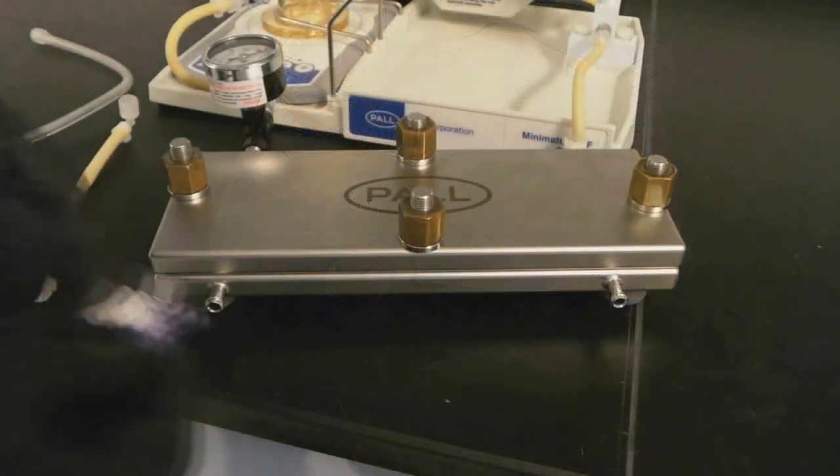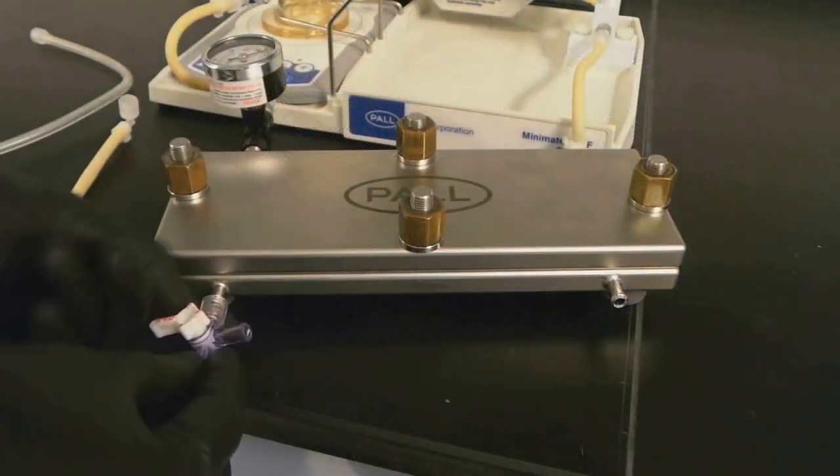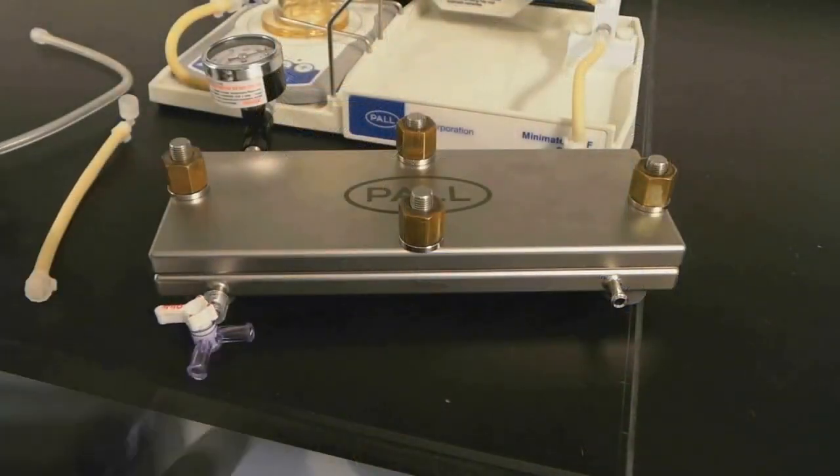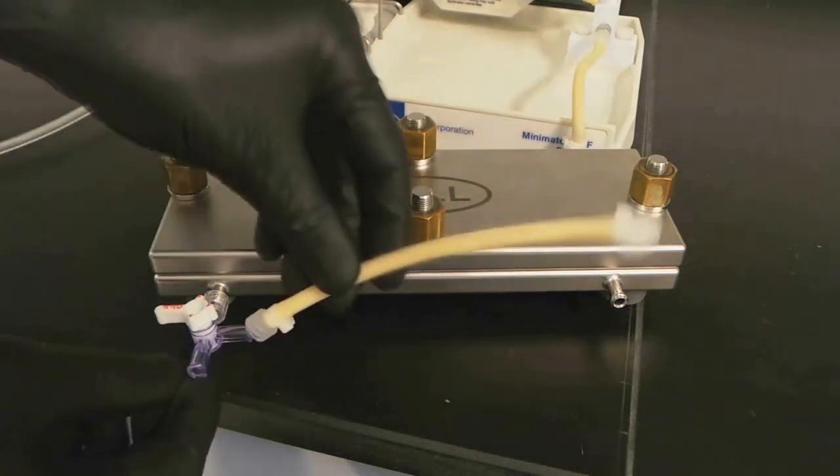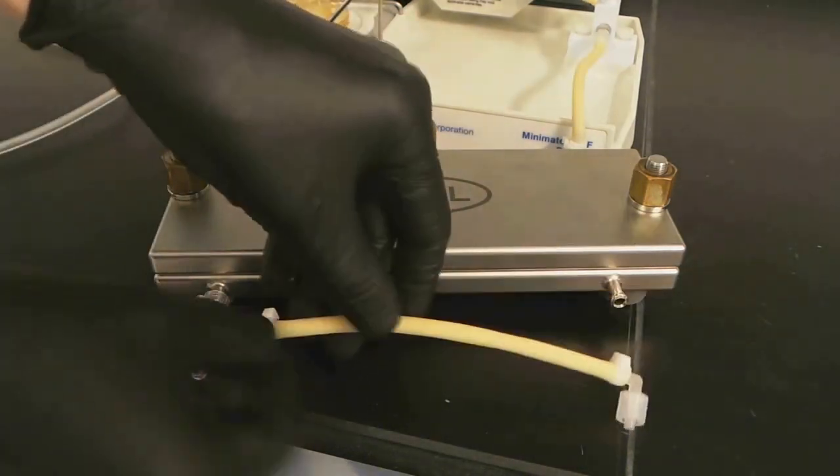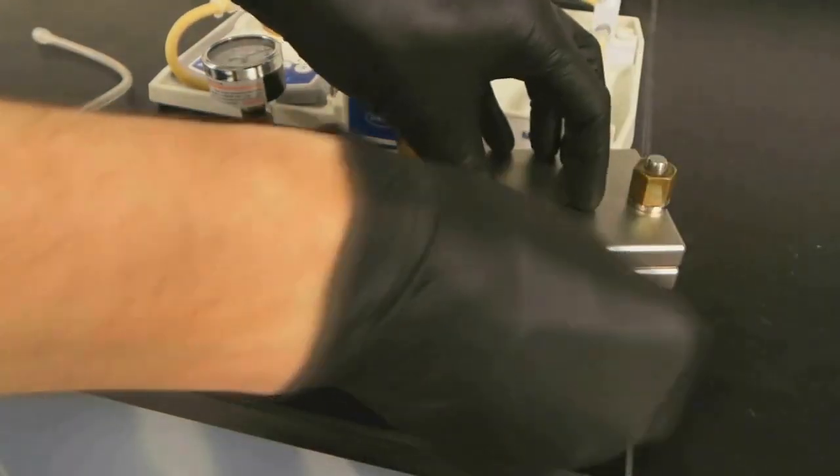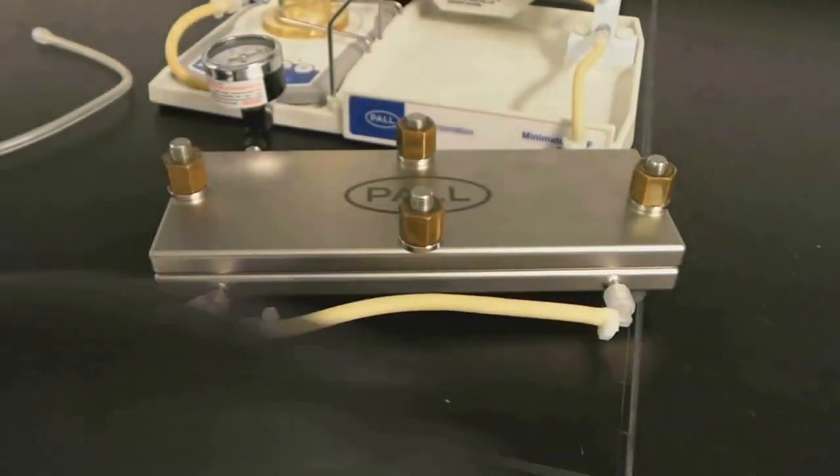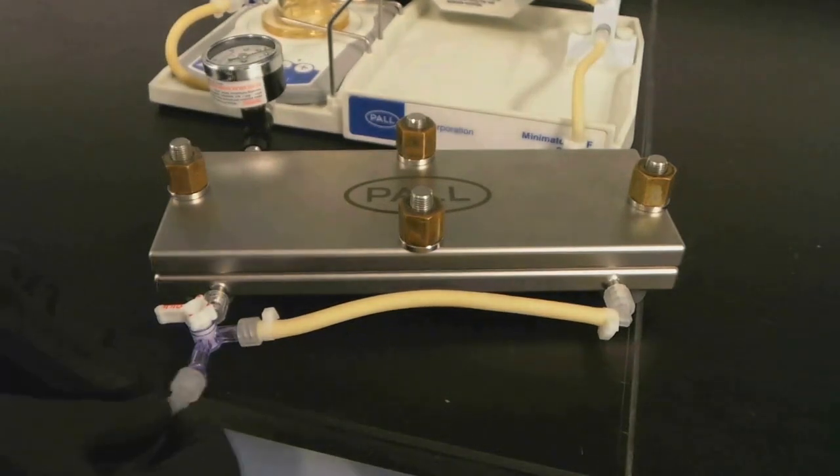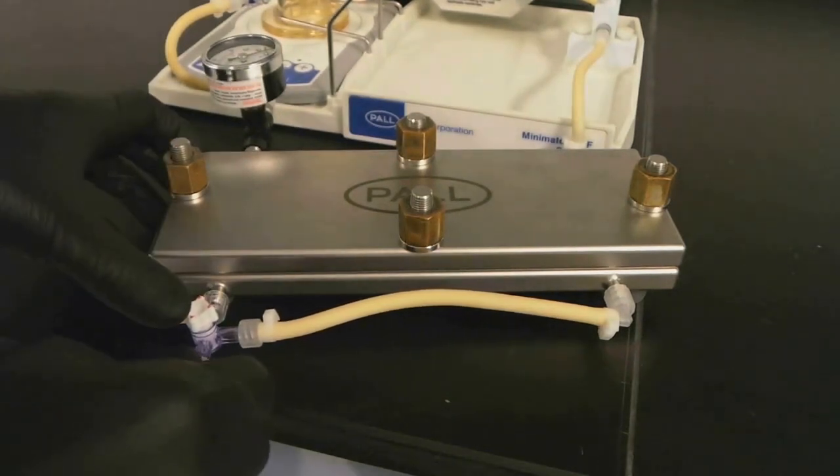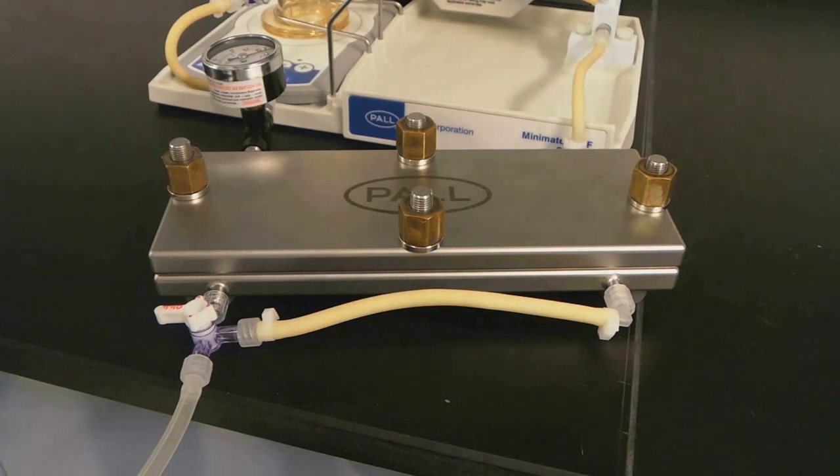On the opposite side of the holder, attach a three-way valve to the filtrate outlet. Then connect another piece of tubing from the T to the opposite port on the same side. Finally, connect another piece of tubing from the valve and place the tubing into a waste container.